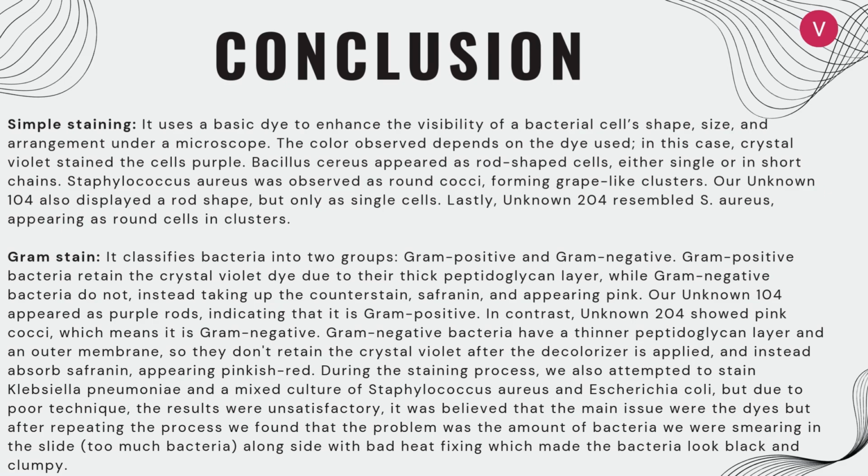During the staining process, we also attempted to stain Klebsiella pneumoniae and a mixed culture of Staphylococcus aureus and E. coli, but due to our poor technique, the results were unsatisfactory, and we believe our main issue was the dyes. We found that the problem was the amount of bacteria we were smearing on the slide. We were putting too much, alongside bad heat fixing.